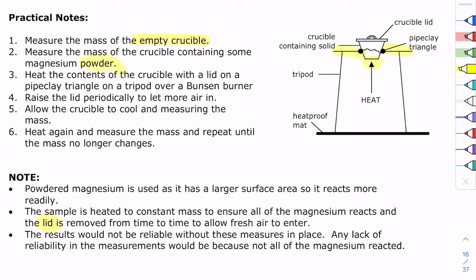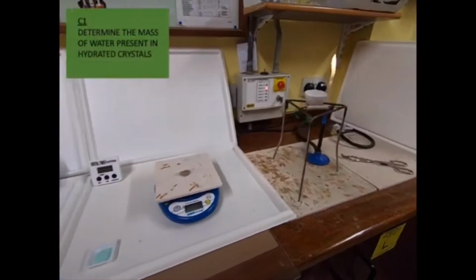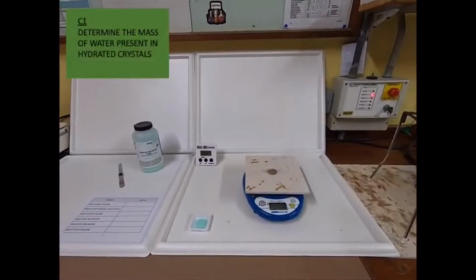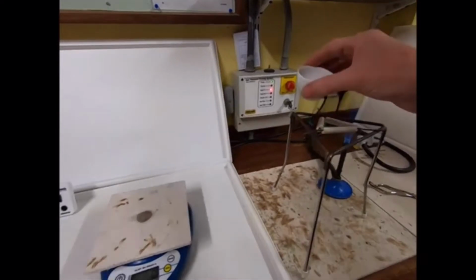Any lack of reliability in the measurements would be because not all of the magnesium had reacted. Now we can have a quick look at this experimentally. So here is all of the practical stuff that you would need. You can see there what the pipe clay triangle looks like. So it's a little triangle shaped and the crucible sits right in on it.